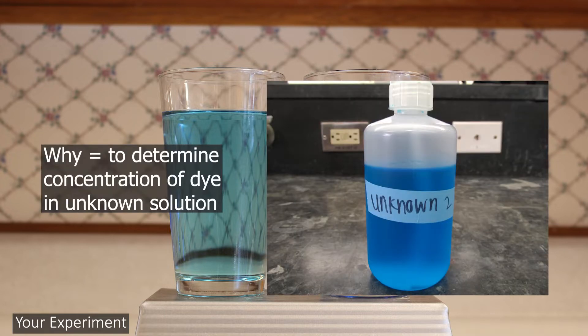The why is fairly straightforward. You're going to determine the concentration of dye in a solution.